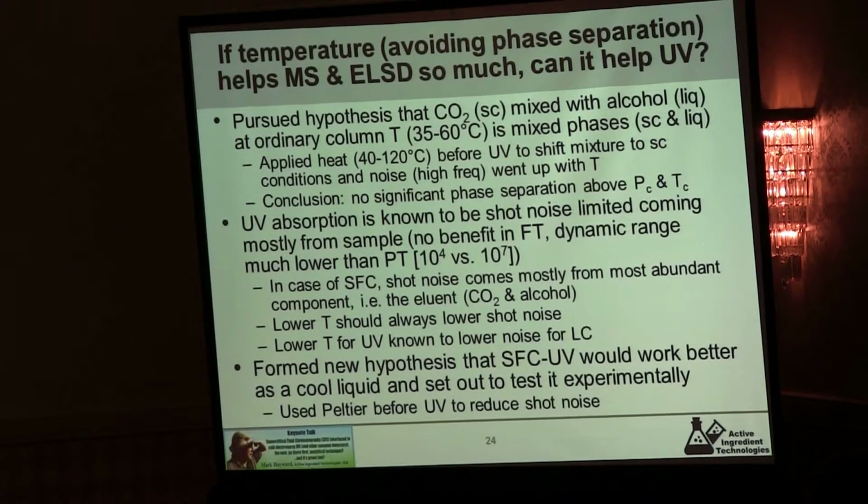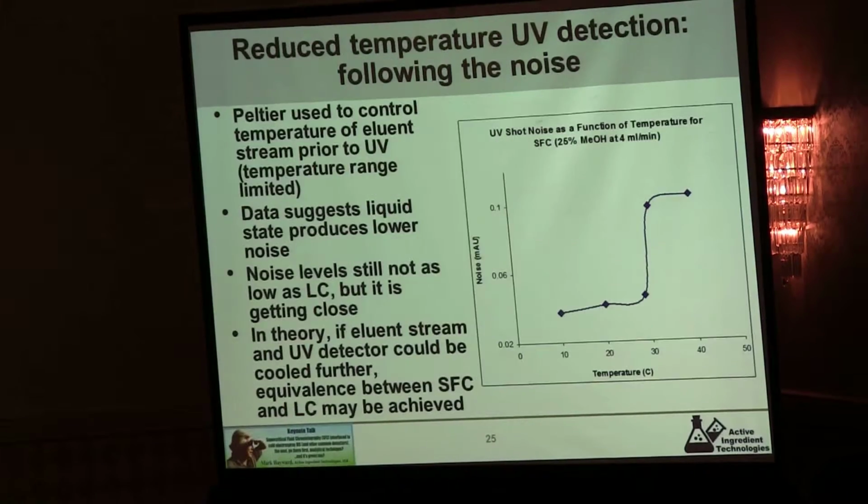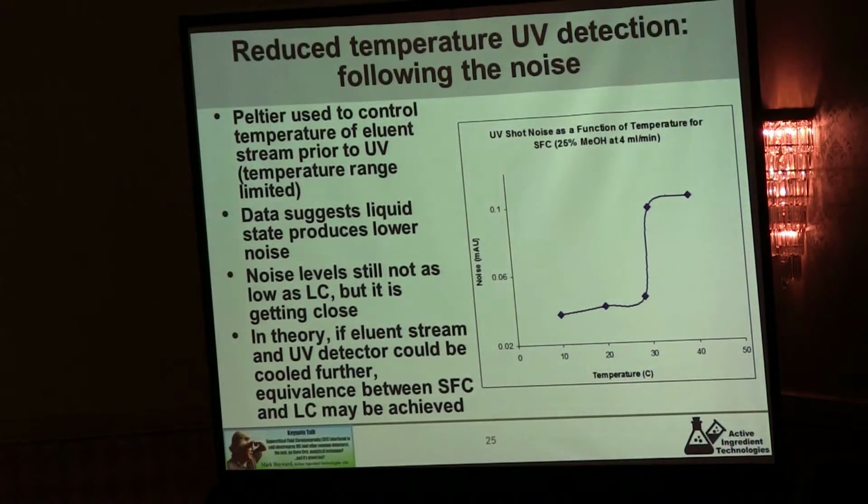And that led us to look at temperature, but in this case we looked at temperature in the opposite direction, lowering temperature. So noise has always been a problem in UV with SFC, and what we found is by cooling the eluent before it goes into the UV detector, we can actually lower that noise quite a bit.